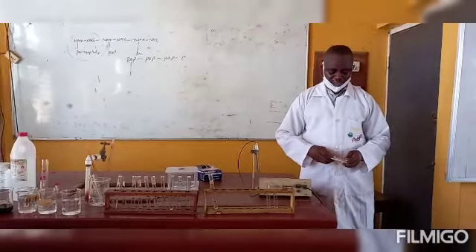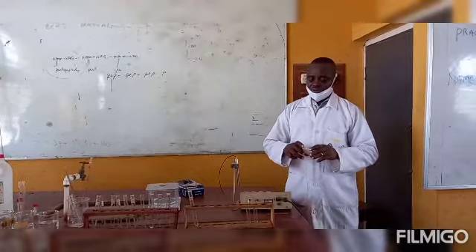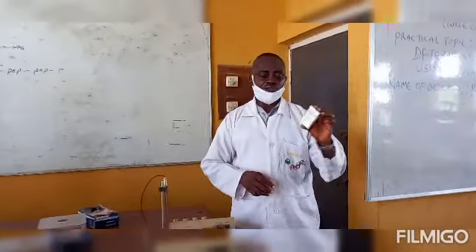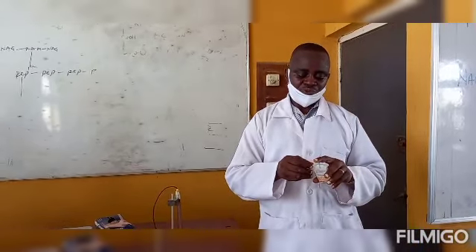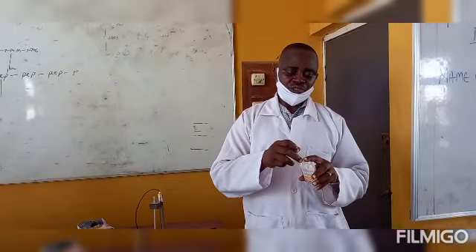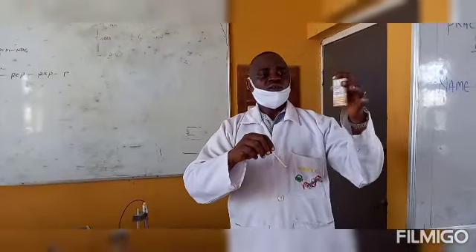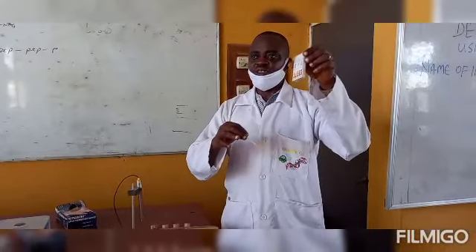There is another method of determining the pH of a solution through the use of a universal indicator paper. It comes in different sizes too, in the form of a paper strip. All you need to do is take out the strip and dip it inside the solution you want to measure. You already have coded colors that have been graded according to the level of the pH.